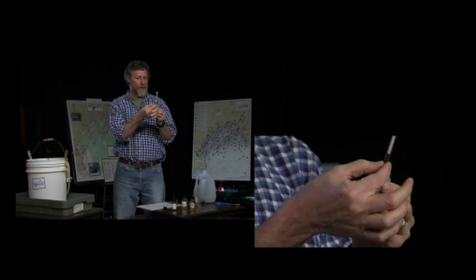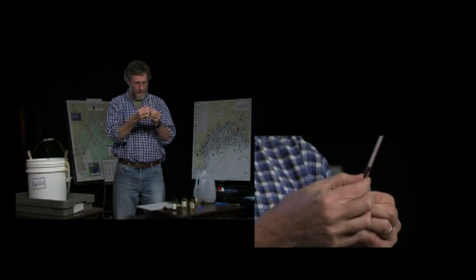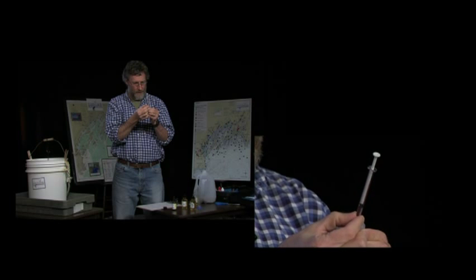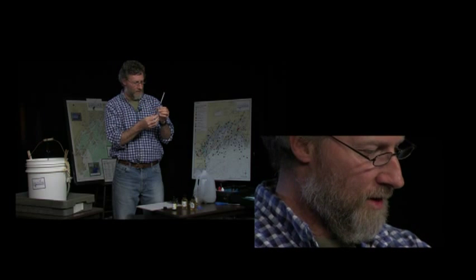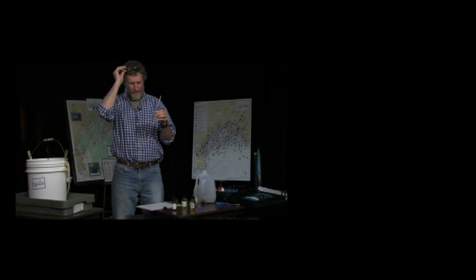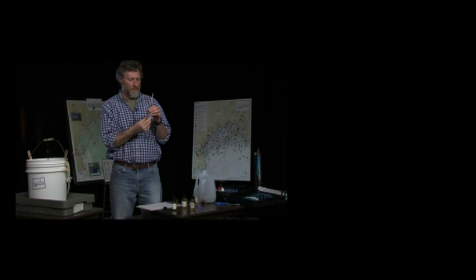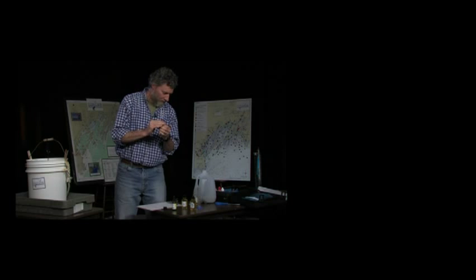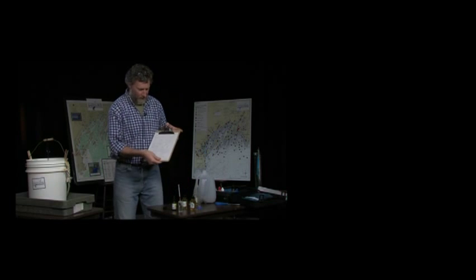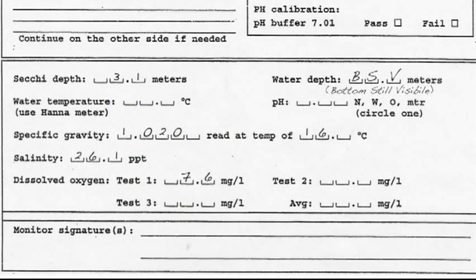Now what we need to do is read the scale on the syringe. And the scale here, it looks like we're at 7.6 on the scale from 0 to 10. So 7.6 means that there's 7.6 milligrams per liter of oxygen in the sample of water. So on our data sheet, where it says dissolved oxygen in this lower portion, we would write down 7.6 for our first sample, which was the first bottle we just did.